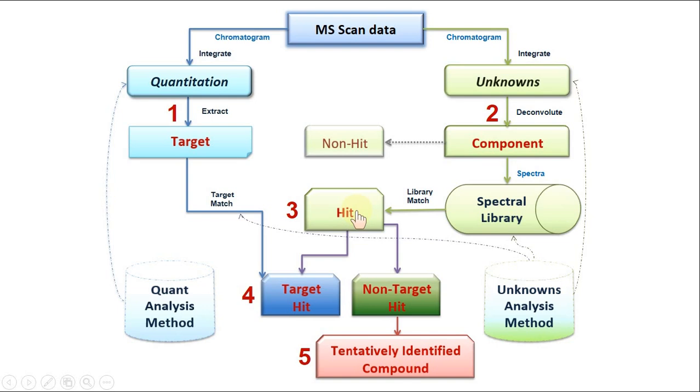The purpose of this non-target workflow is to match up against the targets and to produce a non-target tentatively identified compound list. But the point I'd like to make here is that this is a searching workflow where components are searched against the libraries presented to get good hits.